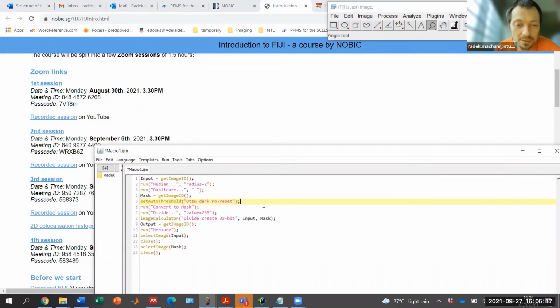So let's do, because especially one limitation here is that it runs exactly the same code on every image in the folder. But sometimes you might want to do something more than that.